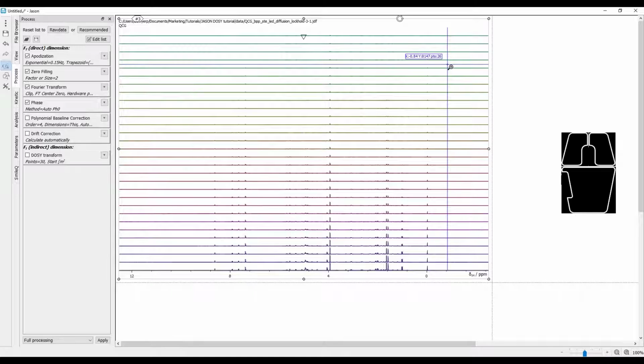The first thing we're going to want to do with these spectra is to ensure that they're correctly phased and that the baselines are flat and sit at the 0 point. If there are any phase distortions in the spectra, or the baselines are curved or don't sit at 0, this can negatively affect the final quality of the DOSY spectrum. Now, peak-shaped distortions and progressive phase errors are usually the result of an issue in the experiment setup, which is beyond the scope of this video.